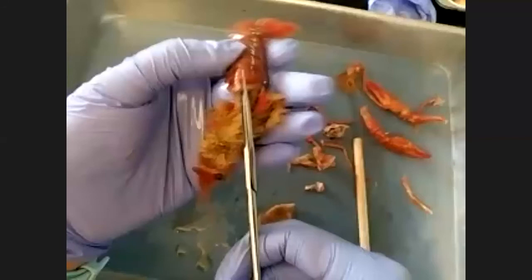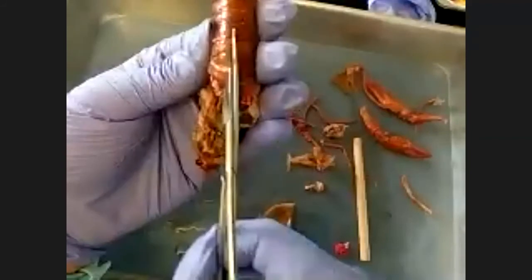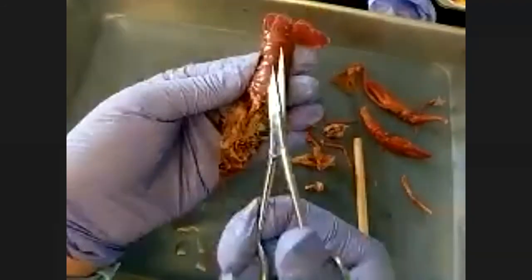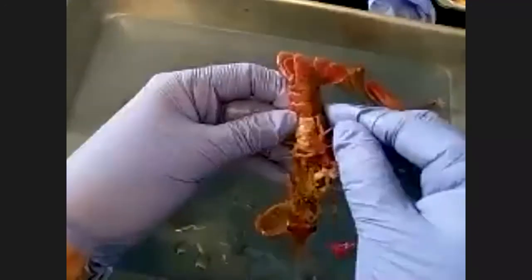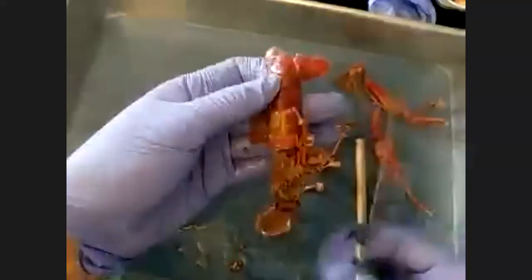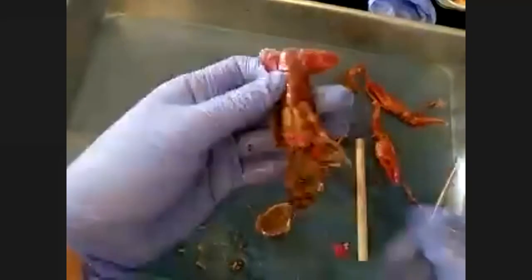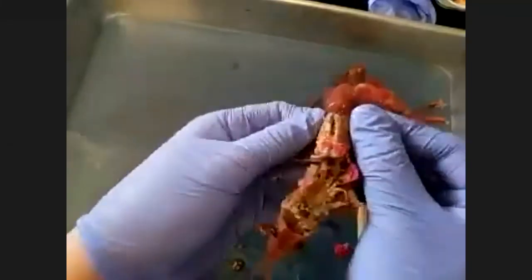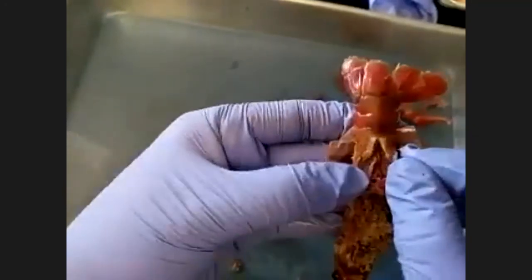All right, so I'm gonna go down the tail. This is just like a lobster tail if you've ever eaten lobster. This is where all the delicious meat is. Crawfish, the same thing. I mean, they're closely related because they're crustaceans. So I'm pulling back the exoskeleton to expose that tail. I think I need to go a little bit further down. Yeah, unfortunately, I cut through it in this hour. So that's unfortunate.